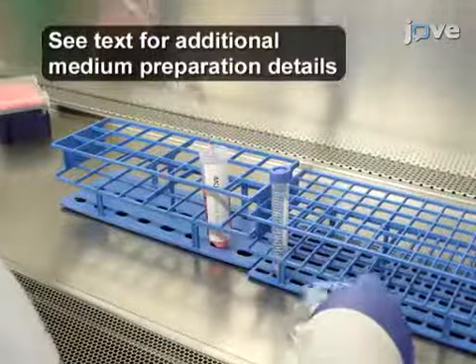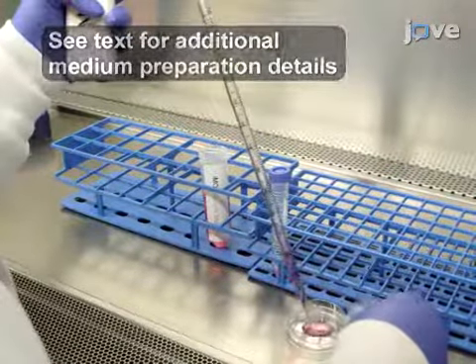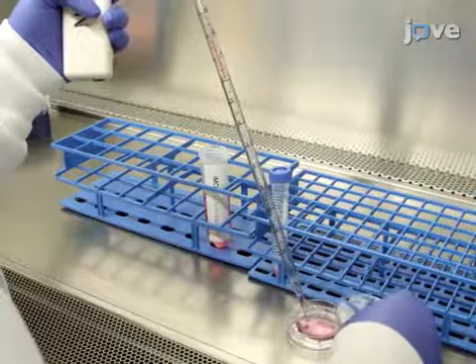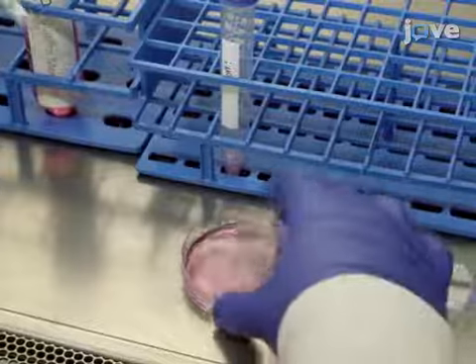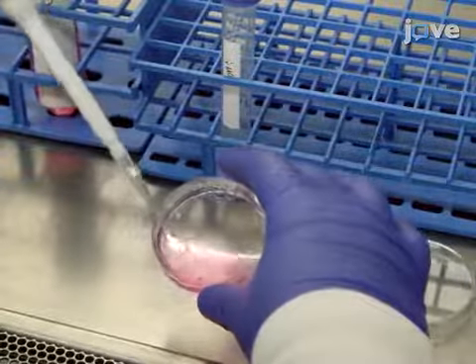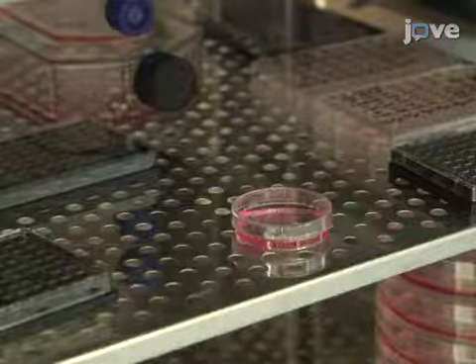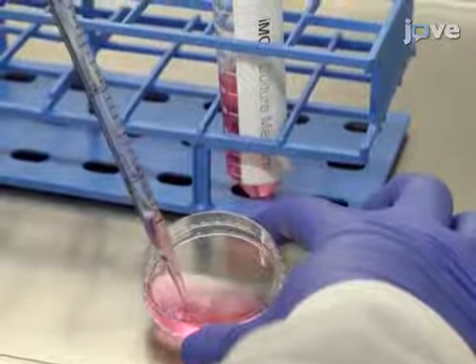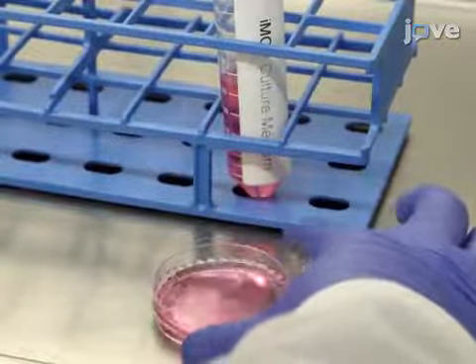After preparing the culture medium as described in the text protocol, use 3 milliliters of this liquid to plate 1 × 10⁶ immortalized multipotent otic progenitor, or iMOP, cells into a 60 millimeter tissue culture dish. Incubate the cells for 5 to 7 days at 37 degrees Celsius with 5% carbon dioxide. Every other day, double the volume of liquid in the culture by adding fresh medium.